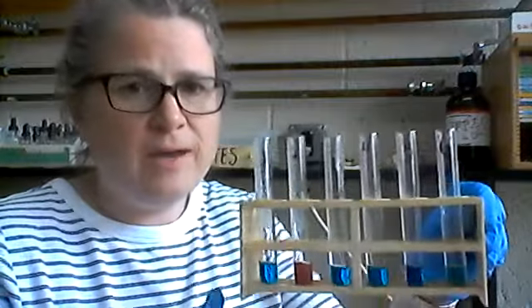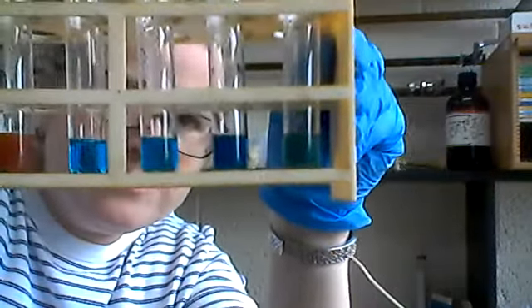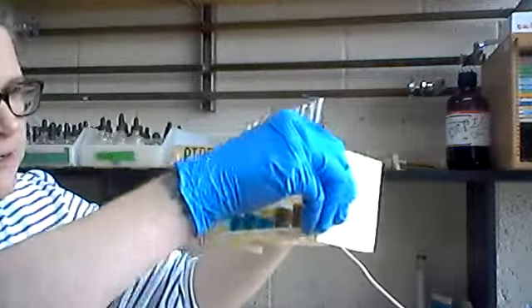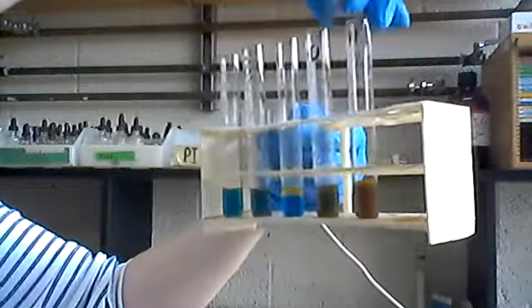Okay, so the Benedict's reagent has just come out of the hot water bath, and you can see some pretty dramatic changes here. The amount of reducing sugars makes it turn different colors. So this brick red has kind of the most reducing sugars. This one is a little bit of a greenish color. And we can see some others here, this one here has gone pretty green. And this one's on its way to a brick red. So again, I'll take photos of those to post.